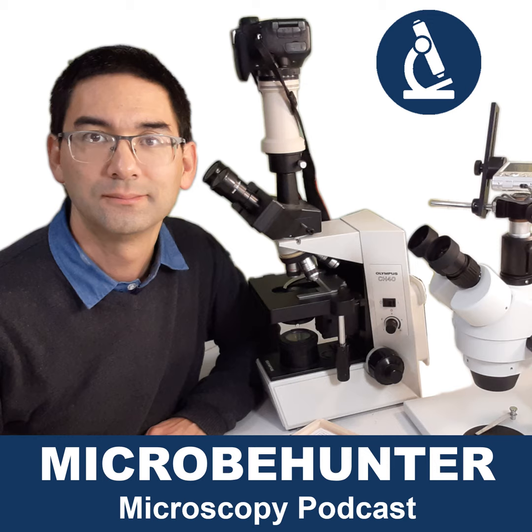So mistake number 2, keeping your microscope not covered. This will collect dust, and sometimes quite a lot of it. So make sure that you vacuum clean your room frequently where you have your microscope, put a dust cover on top of it. Dust is almost not avoidable. The dust is so ubiquitous, can be found everywhere. Very difficult, if not impossible to avoid. But you can at least reduce the buildup of dust on the microscope.